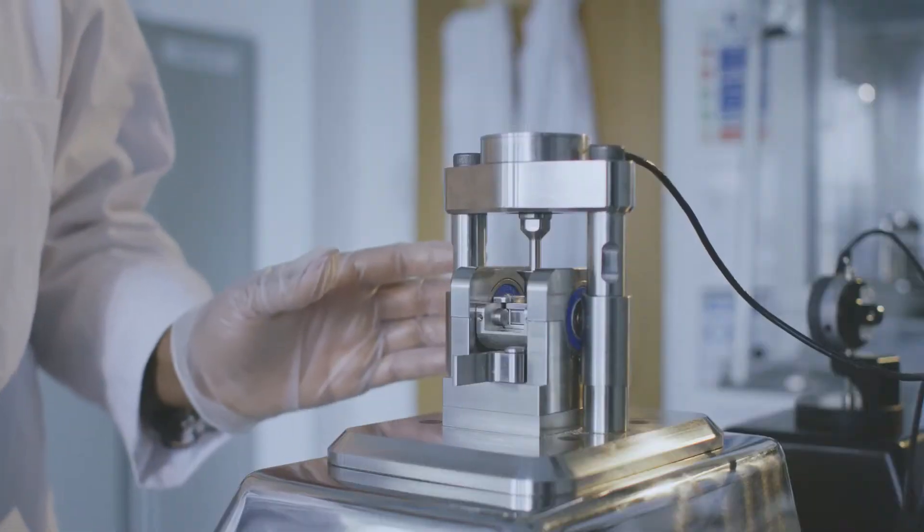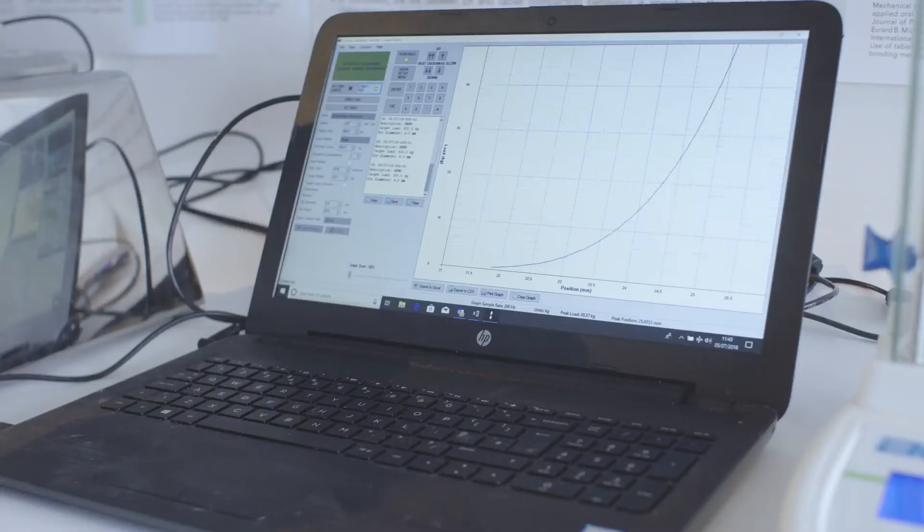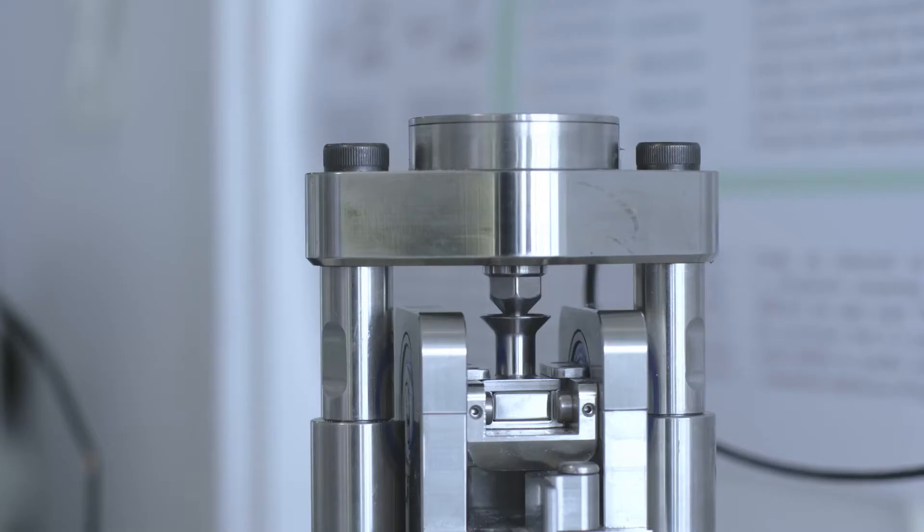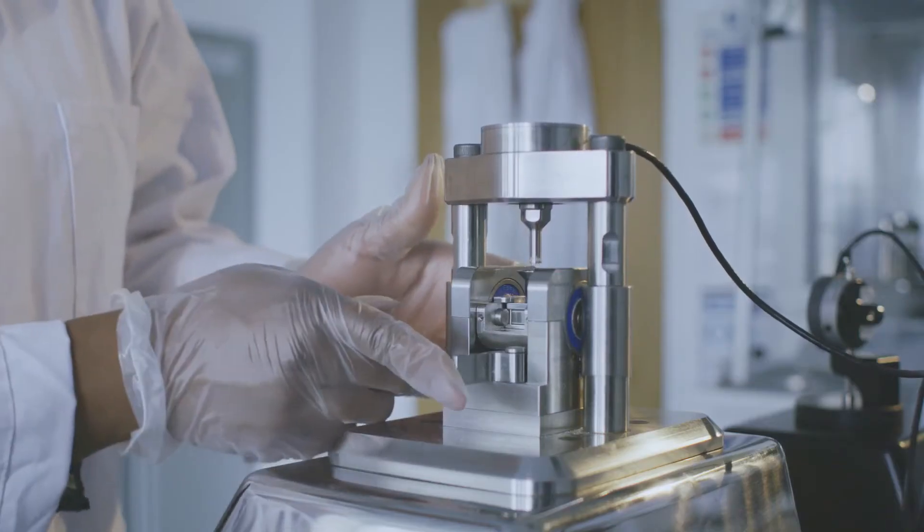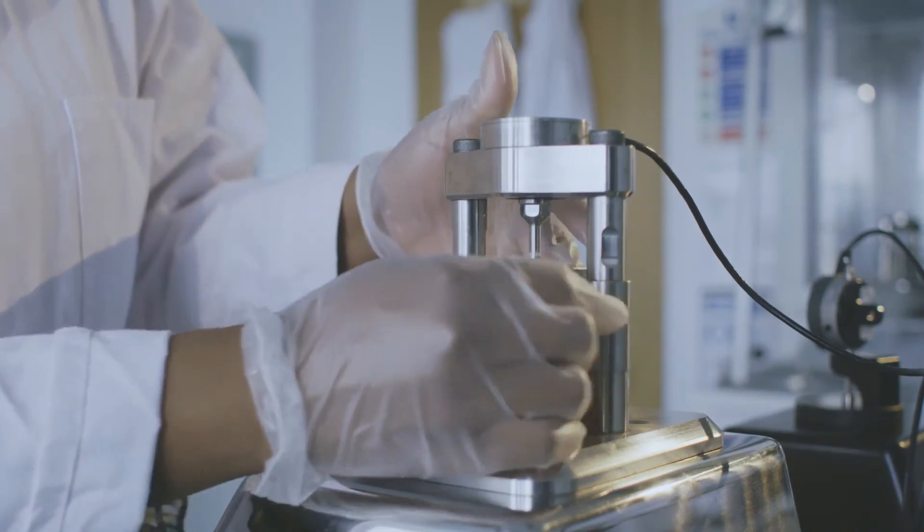The Gamlin system tests the compaction properties defined by the new USP1062 Tablet Compaction Characterisation Monograph, as well as checking the lubrication and the elastic properties of the sample.